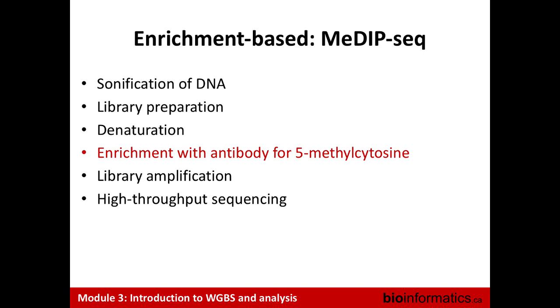Unfortunately, we don't have Martin. Martin can explain this better. But I think what to mention here, if I may, is that this is a very good technique. However, it is not very sensitive to low CpG density. So if you do genome-wide, although it's a great technique, you will be more sensitive to certain CpGs. So this has some bias to CpG density.